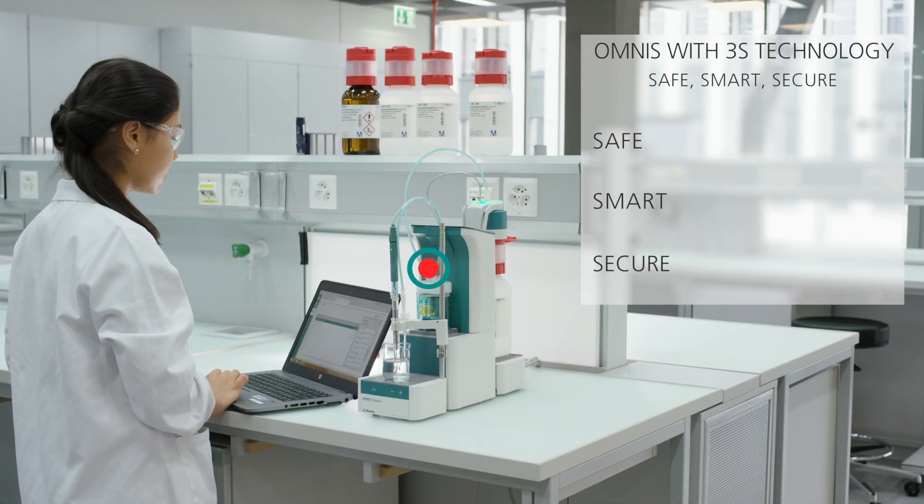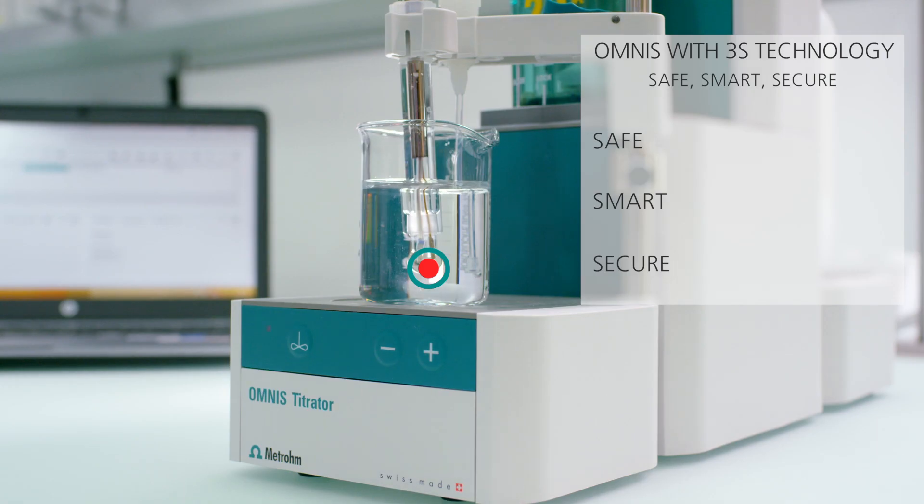Omnis with 3S technology. Reagent Exchange. Safe, smart and secure.